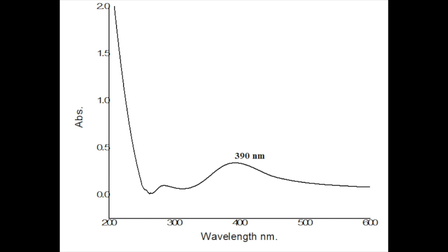By looking at the way the graph turns out across all wavelengths, we can actually determine the properties of the substance. On the other hand, the quantitative data that we'll be measuring is the lambda max. The lambda max is the wavelength in the absorption spectrum where the absorbance is at a maximum.